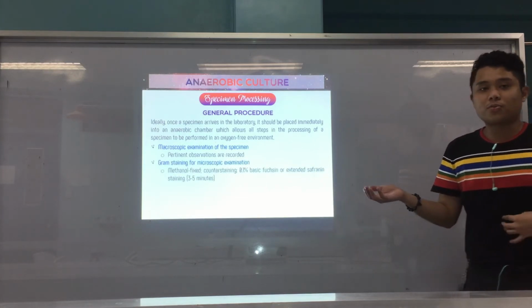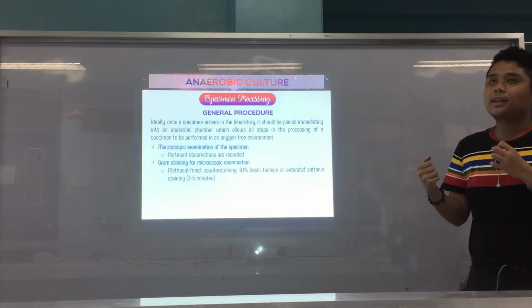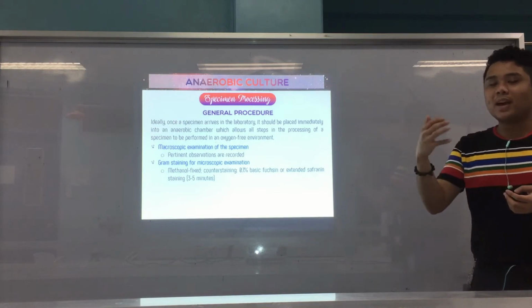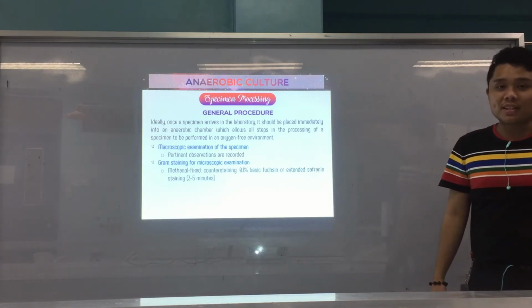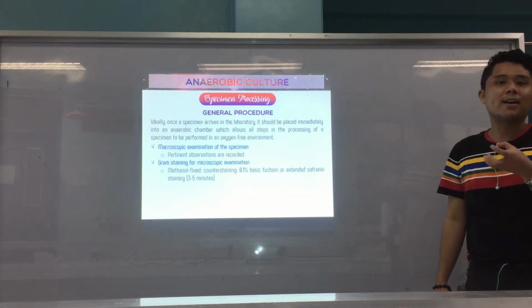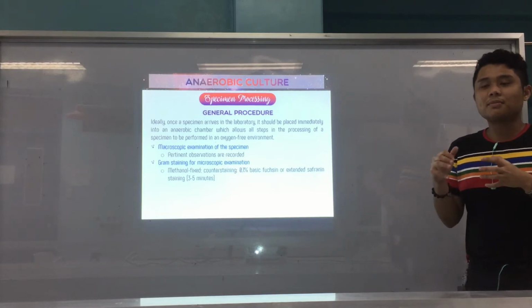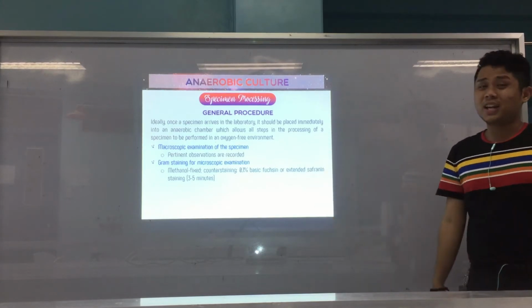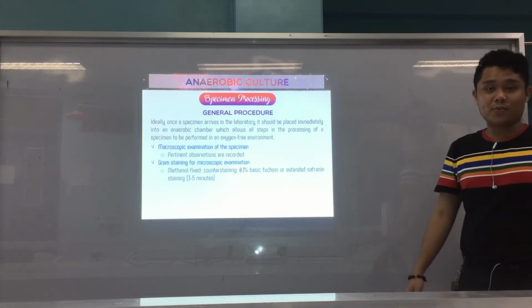Now for anaerobic organisms, some of them do not hold on to the safranin that well. So we can make counter measures or modifications for that. We can use 0.1% basic fuchsin, or we extend the time for safranin to 3 to 5 minutes to better ensure that they take up the safranin. And of course, fixation is methanol fixed, not heat fixed.